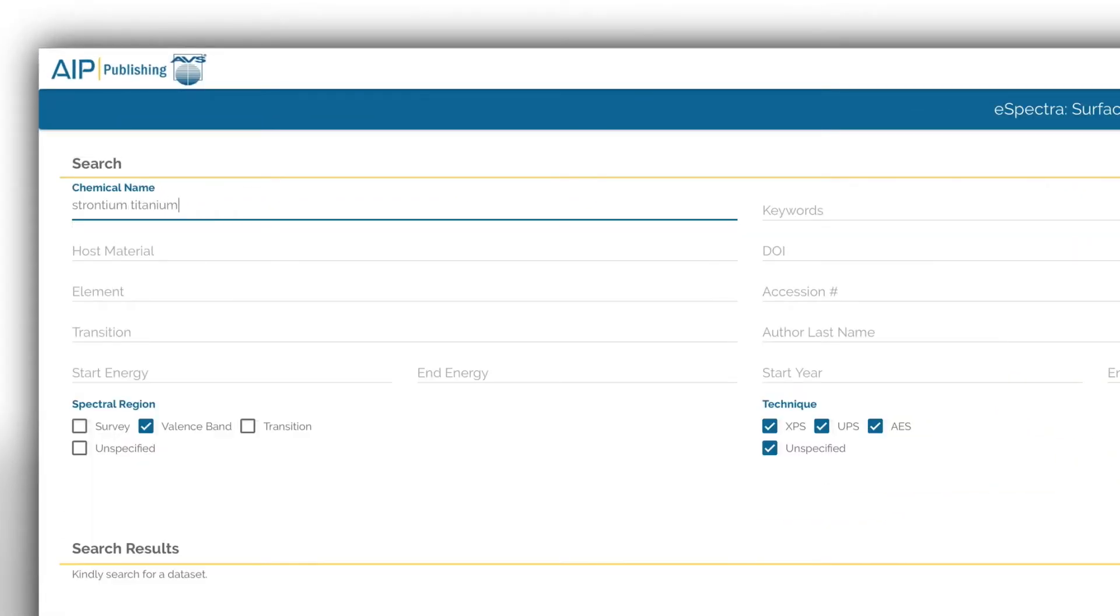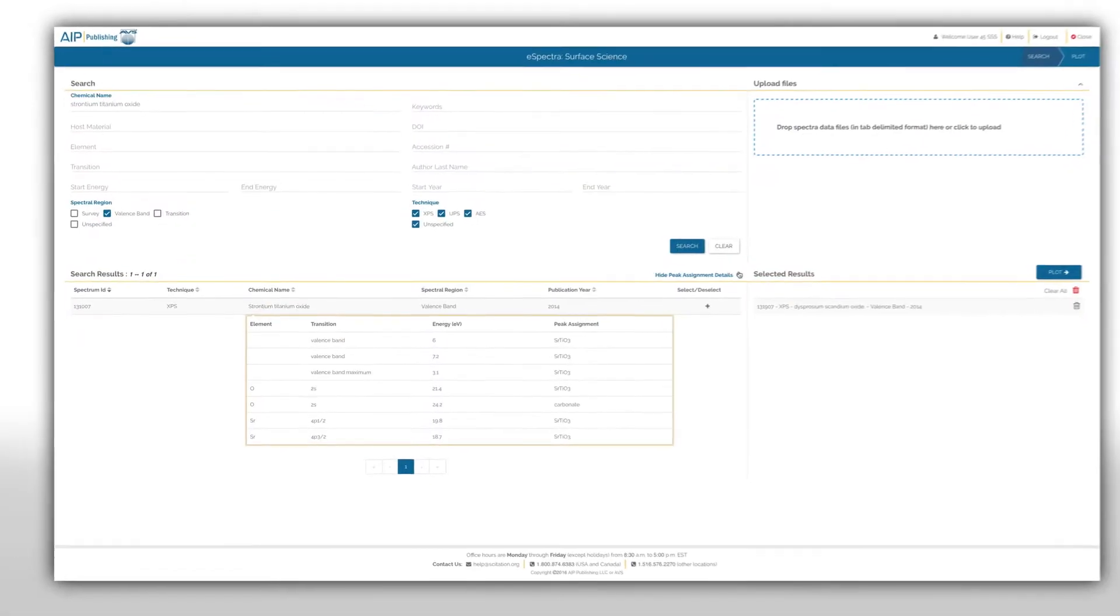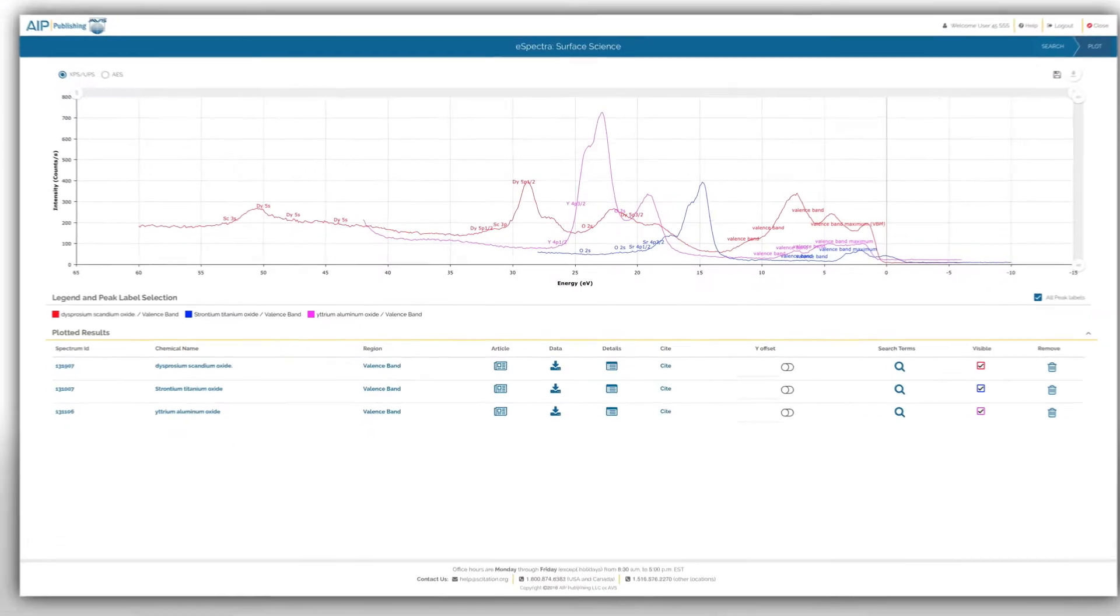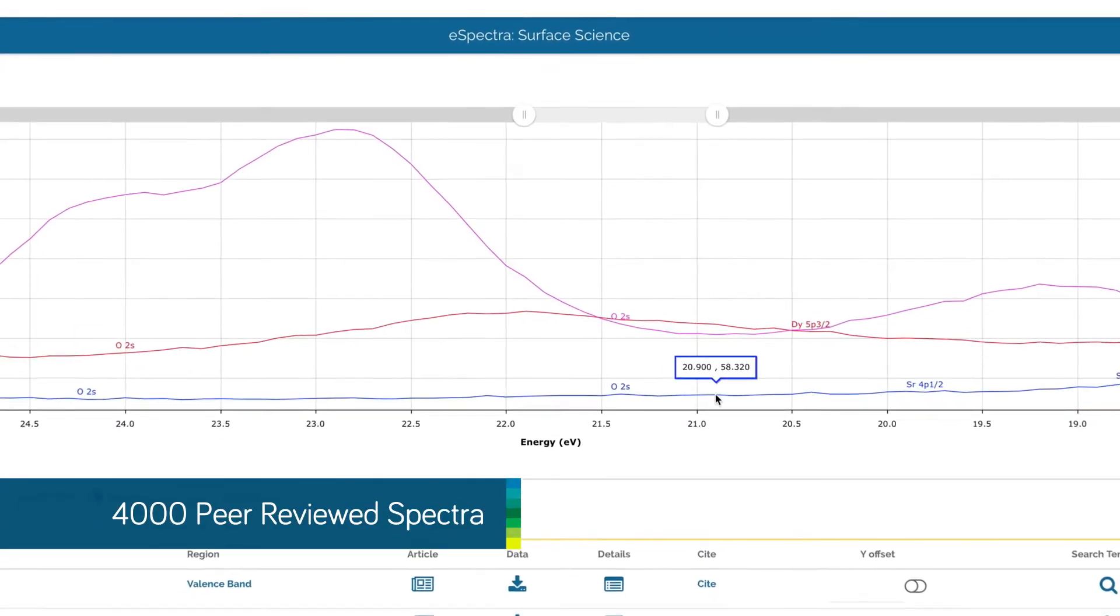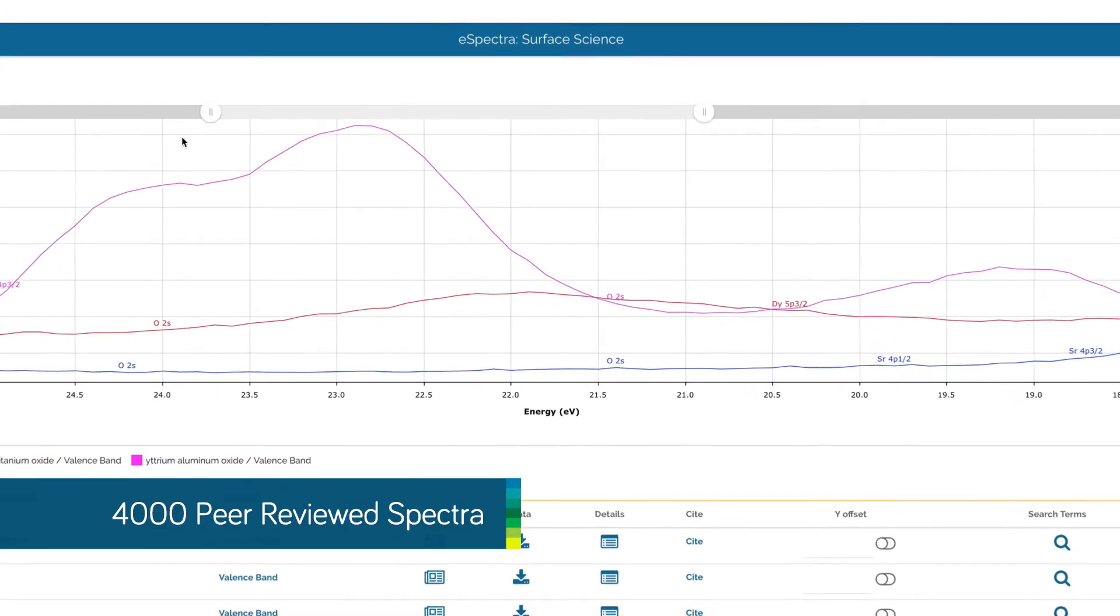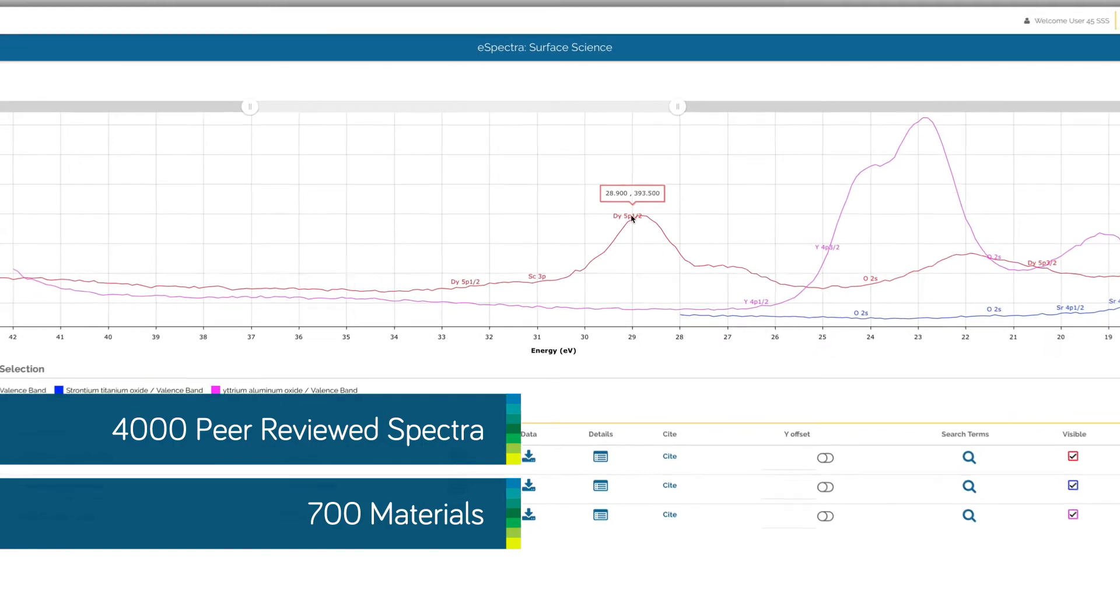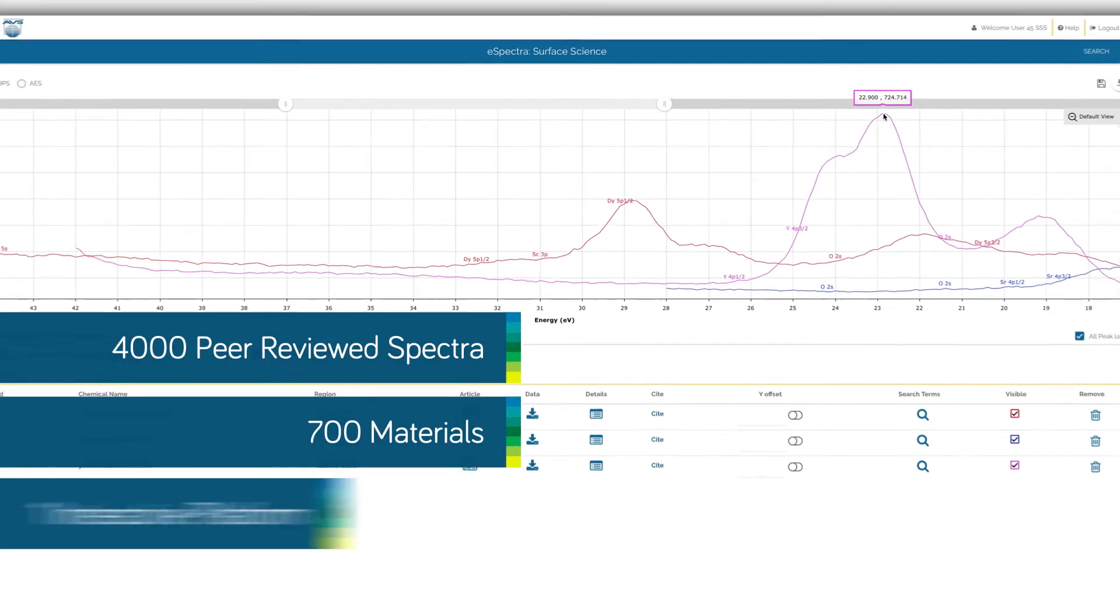eSpectra lets you search and plot over 4,000 peer-reviewed spectra from more than 700 different materials, all on one easy-to-use interactive platform.